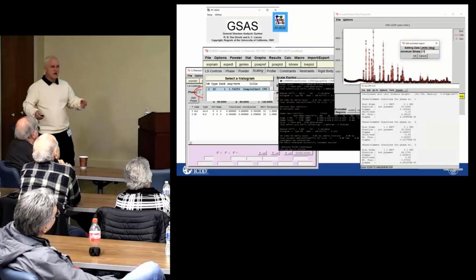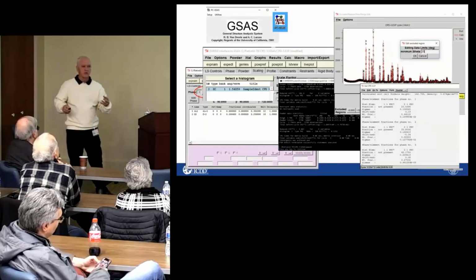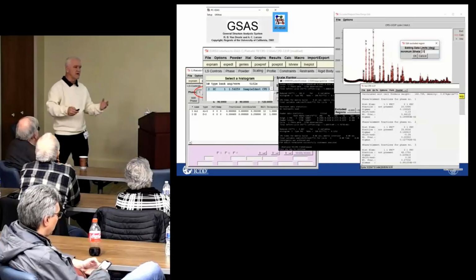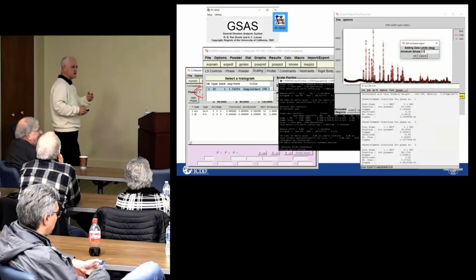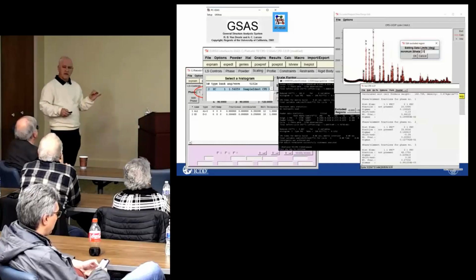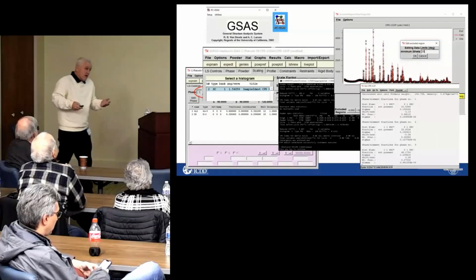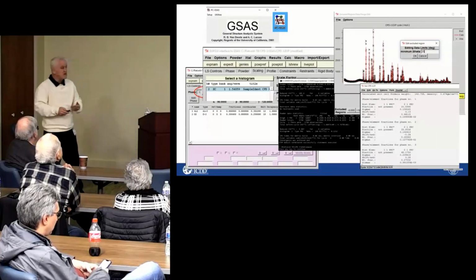That brings us now to Rietveld techniques. And for many years, we had Rietveld, but you needed software that was what we would call user-unfriendly. And so at ICDD for a number of years, we have taught a Rietveld clinic. And for a number of those years, we were using GSAS. We call it GSAS-I, but we use GSAS.